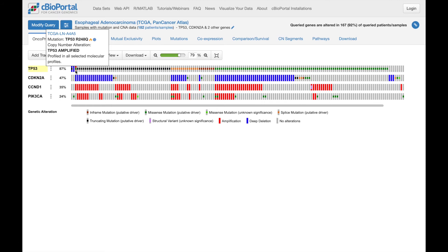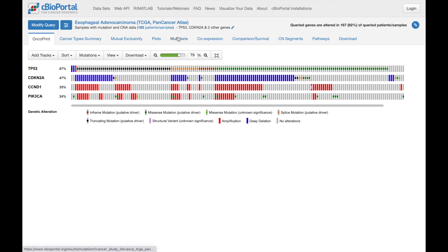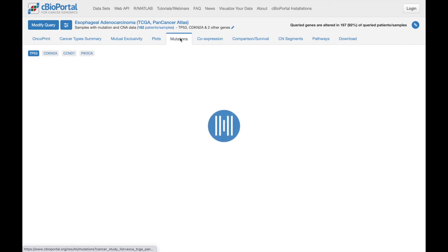OncoPrint provides a great summary of alterations, but one common question is how to look at the specific mutations in detail. And for that, we have the mutations tab.